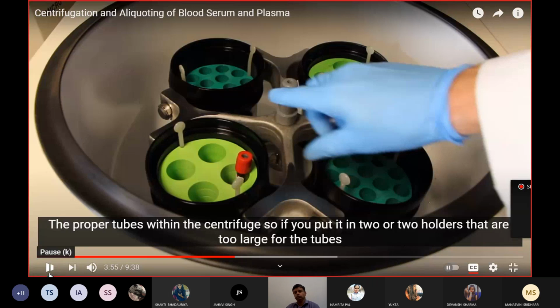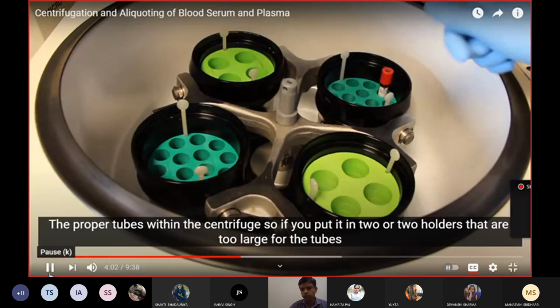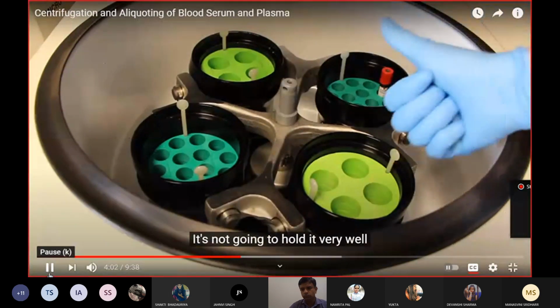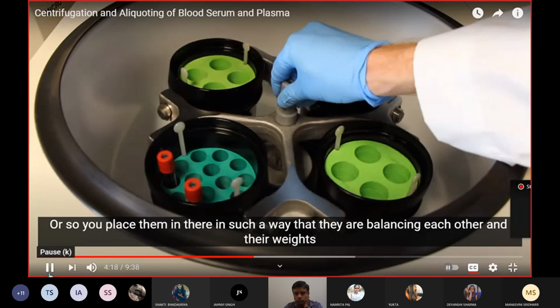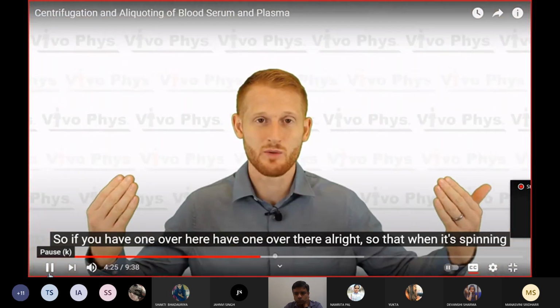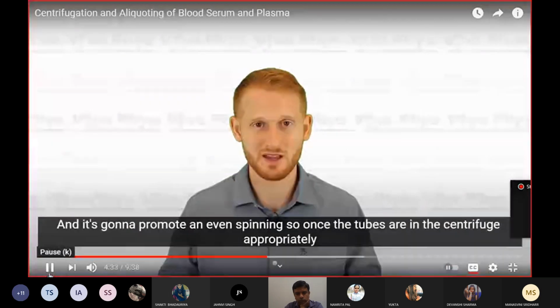Use the proper tubes within the centrifuge. If you put it in tube holders that are too large for the tubes, it's not going to hold it very well, and you don't want that. So put it in the right size tube holders for the tubes you're using. All right, the other thing you need to do when you're putting the tubes inside the centrifuge is to place them in such a way that they are balancing each other in their weights. So if you have one over here, have one over there, so that when it's spinning, it's going to have the same amount of weight on both sides of the inside of that centrifuge, and it's going to promote an even spinning.